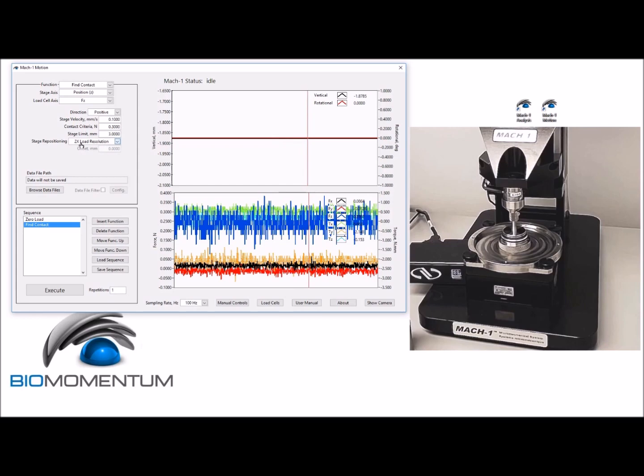We can now execute the sequence and report the current position of the vertical stage axis as the thickness of the sample.